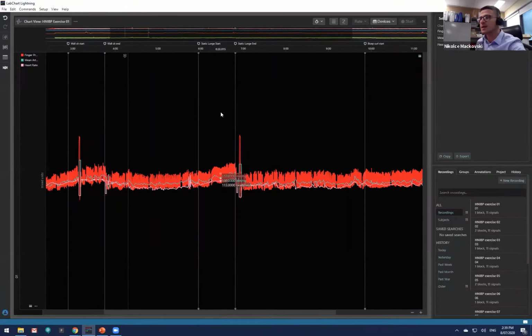So what I want to do is create some regions. So now what I'm going to do is left click in an area like this, and I'm going to press plus. Now, I've actually created some regions already, but what I'm going to do is show you how to start with this. So what I'm going to do first, let me just remove these types of regions and start again. So then you don't actually see any of these. I was practicing this before, that's why you saw them. Okay, so now we have a region.